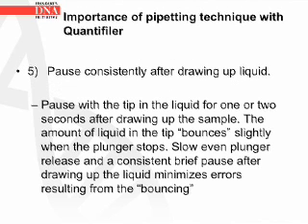Number 5. Pause consistently after drawing up the liquid. Pause with the tip in the liquid for 1 or 2 seconds after drawing up the sample. The amount of liquid in the tip bounces slightly when the plunger stops. Slow, even plunger release and a consistent brief pause after drawing up the liquid minimizes errors resulting from the bouncing.